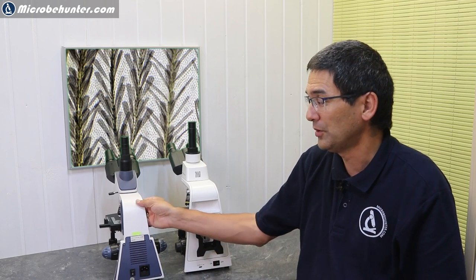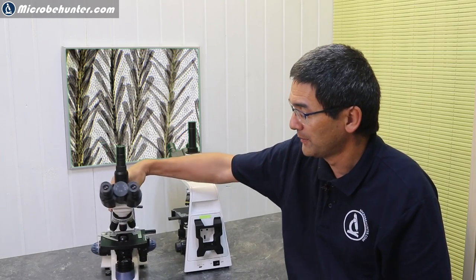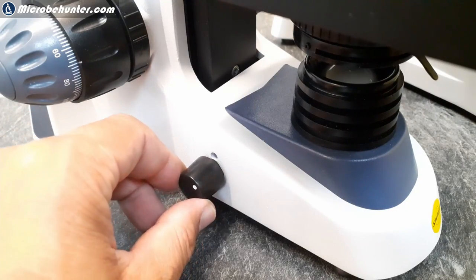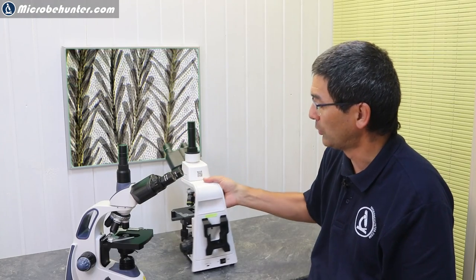Otherwise, the switch, the main switch, is on the back on both sides. Also the light intensity can be controlled—over here there is a knob that can be turned, and over here on the Stellar One there is a little wheel that can be turned.